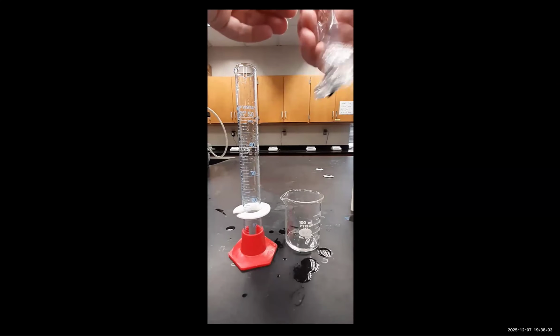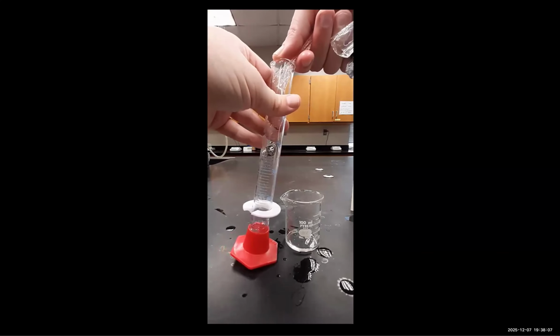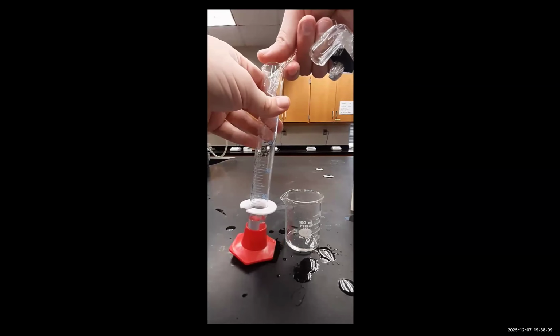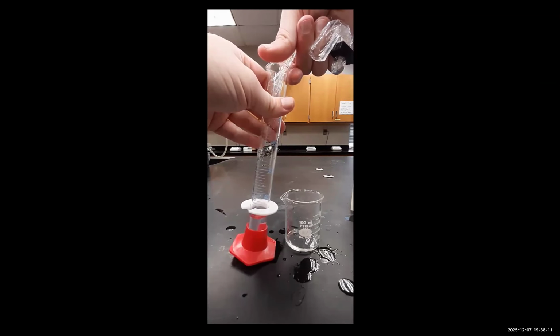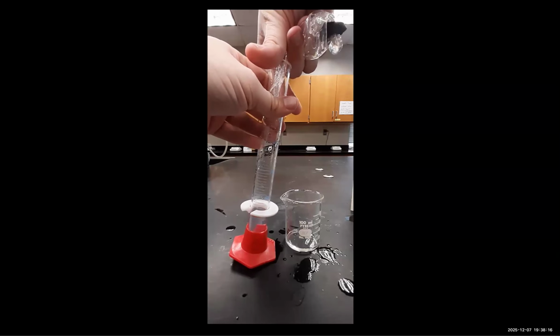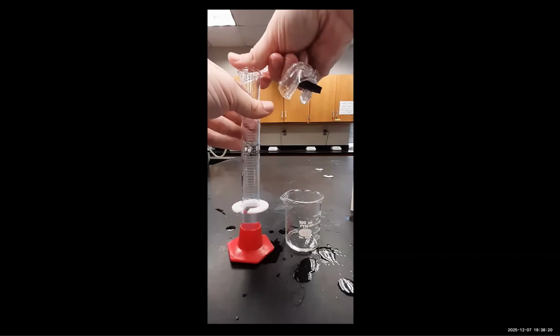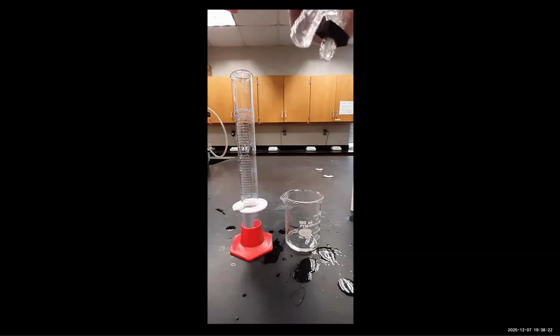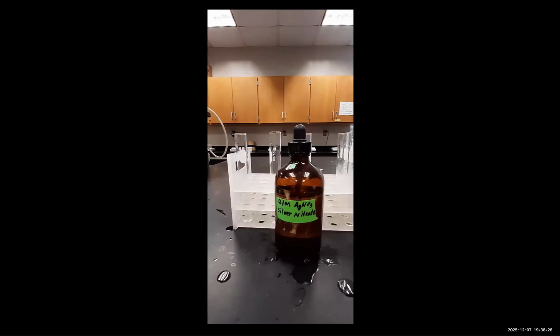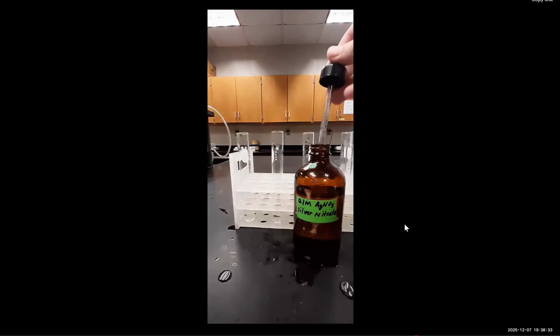So we're trying to figure out what passed through the dialysis bag and what remained stuck in the dialysis bag. Okay, we're now doing the silver nitrate test.